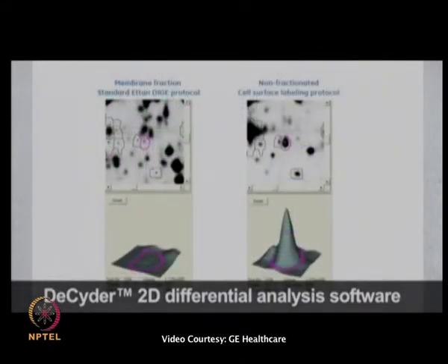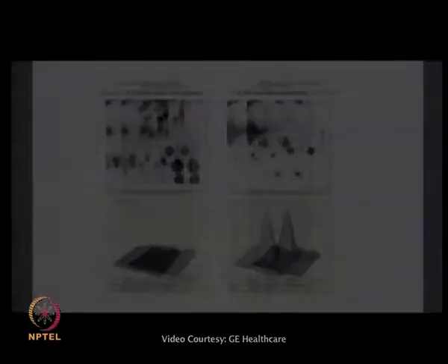Over 80 novel membrane proteins were detected using the cell surface protocol that were not detected with the standard DIGE protocol. For finding the identity of the proteins in the preparative gel, it was necessary to spike with a cell surface sample to facilitate matching back to the spots on the analytical dataset.